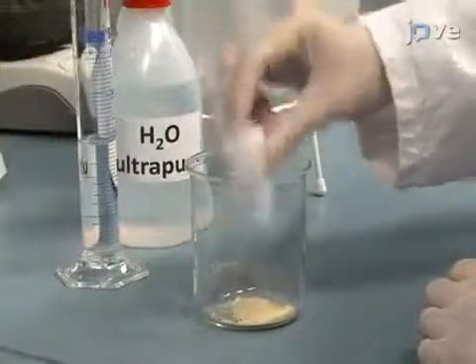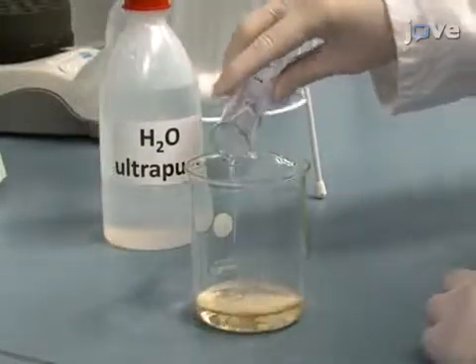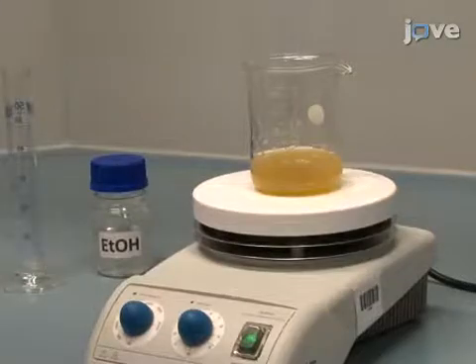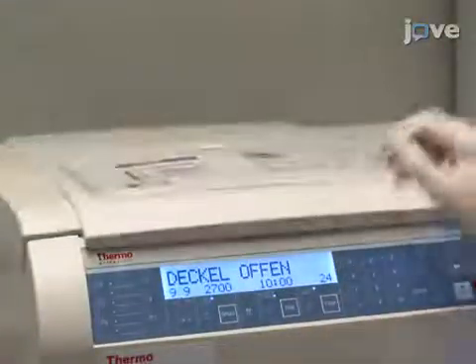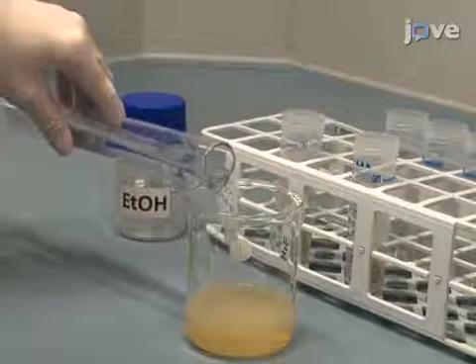Then, dissolve 10,000 units of type H1 aryl sulfatase in 30 milliliters of ultra-pure water. Add to this 30 milliliters of absolute ethanol and stir the mixture well. Centrifuge the mixture at 2650 times G for 20 minutes at room temperature. Combine the supernatant with 90 milliliters of absolute ethanol in a beaker.